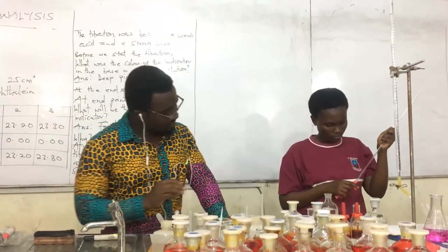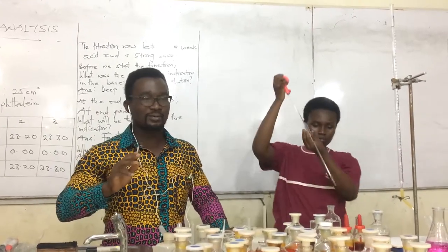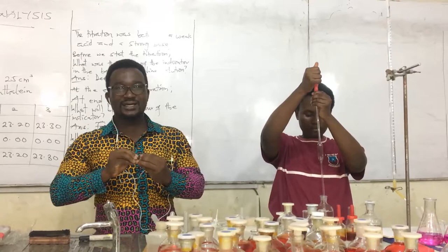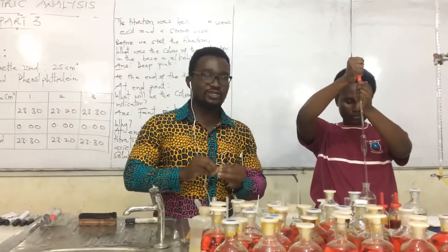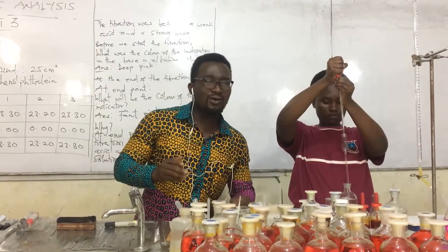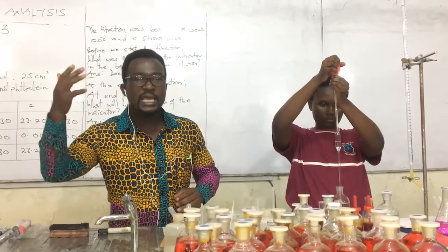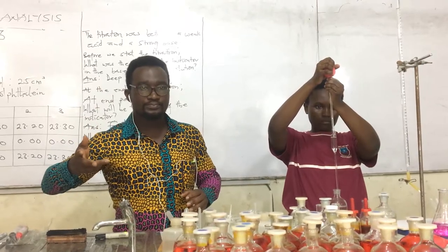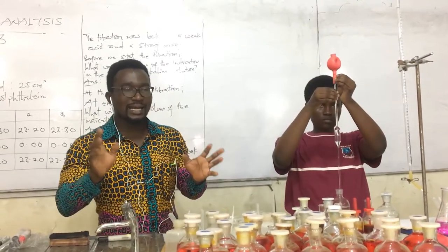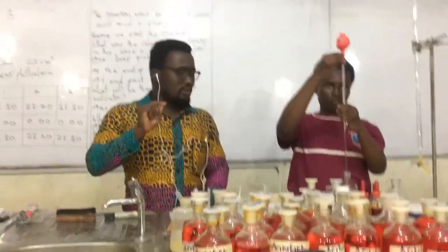Remember, we have discussed from our theory that at the end the solution will be neutral. At the end, when you titrate a strong acid against a strong base, the solution will be neutral at the end point. Now, we have also discussed the color of methyl orange in a neutral solution. We said it will be orange. The color of methyl orange in a neutral solution is orange.